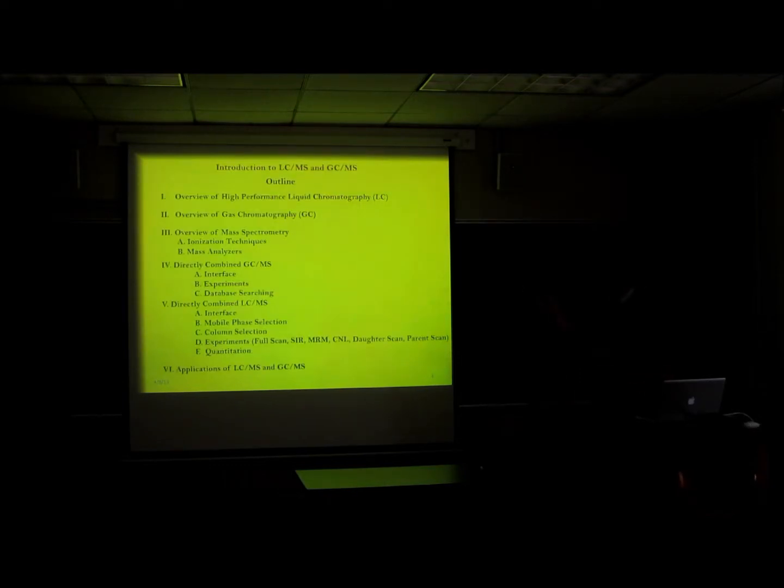I want to start, and I won't go into much detail with this at all, because I'm sure Pete and the other professors who are teaching this course are going to go into a lot of detail on HPLC and gas chromatography. I'll talk about the different ionization techniques with mass spectrometry, as well as the different types of mass analyzers, and what the strengths and the weaknesses are for each of those, especially in the context of doing quantitative analysis.